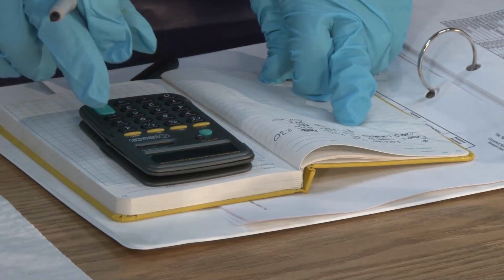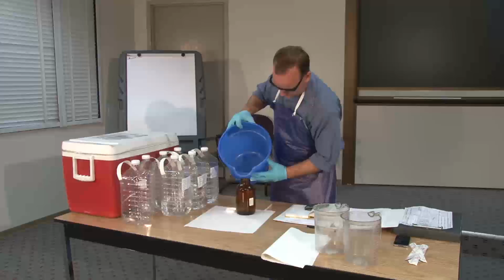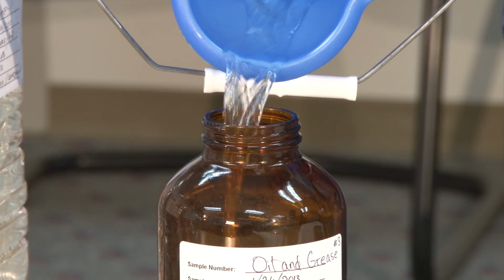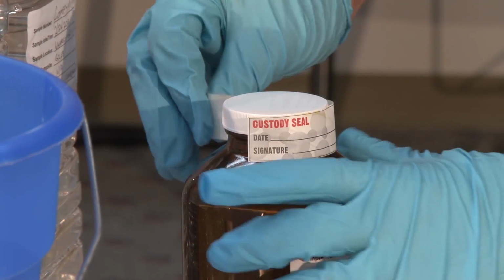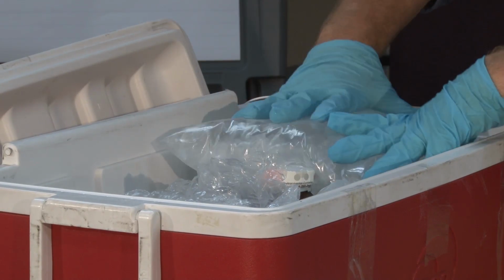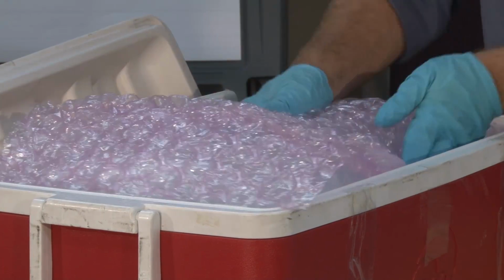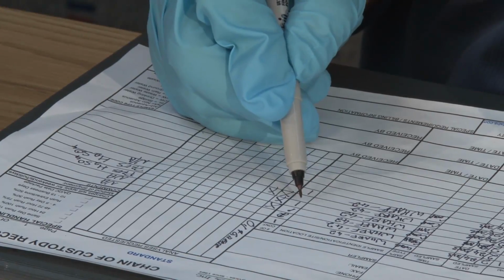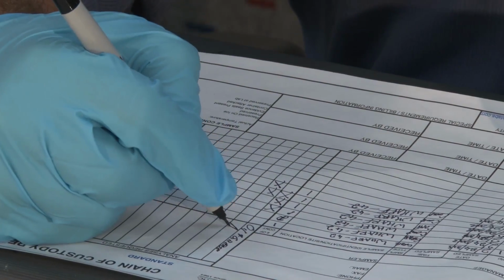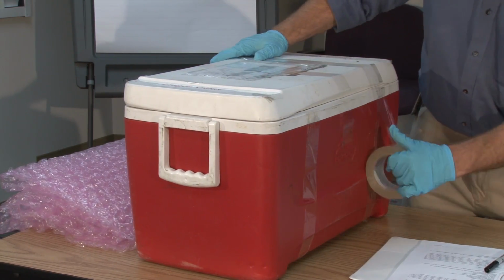Perform calculations and sample compositing inside or in a protected area. Transfer composited sample into appropriate sample containers. Seal sample containers. Pack the samples in the cooler with ice and packing materials. Provide sample information documentation and ensure documentation is protected from exposure to contents. Close and properly seal the cooler.